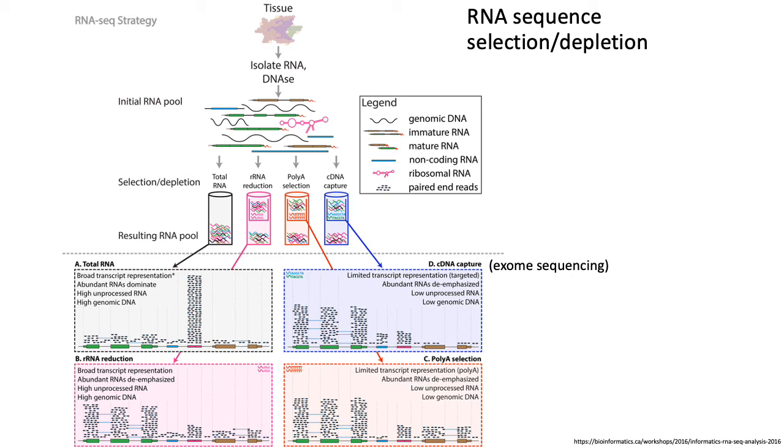But again, in general, cDNA capture is less frequently used, mainly because sequencing is getting more and more cheap, and our processing of even samples like fixed samples is getting better and better, and so it's typically not as necessary to capture and target specific transcripts unless there is one specific or small set of transcripts that you really need to quantify very accurately.